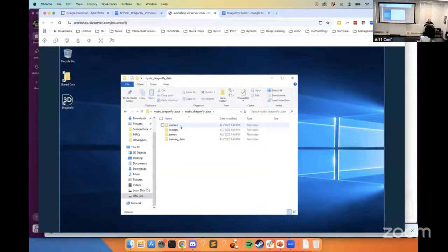Now, actually, you don't need to do anything with it just yet. I wanted to just make sure we had it unzipped, so when we start Dragonfly, we can actually access those files. Let me know if you haven't gotten it unzipped. Okay. Well, there should be a Dragonfly 3D icon on the desktop for you, or there's something already running.